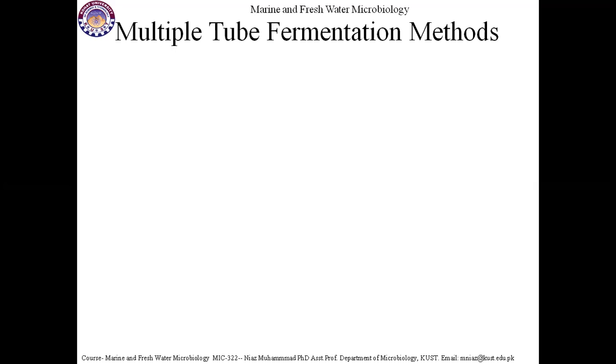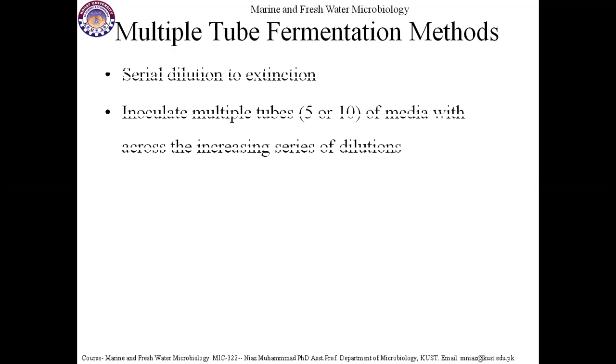And another technique is the MPN method, the multiple tube fermentation method. In this method, what we are doing is serial dilution. We are taking a water sample, and we are taking three sets of test tubes.